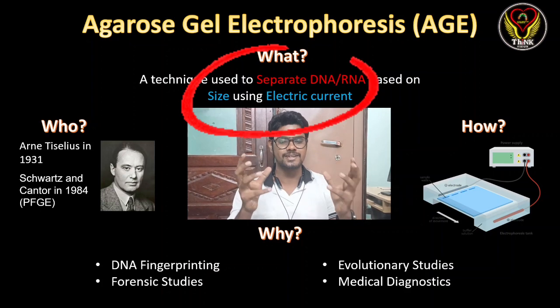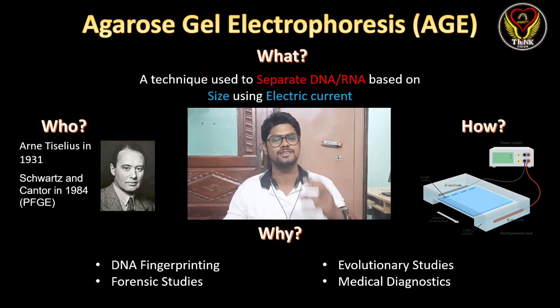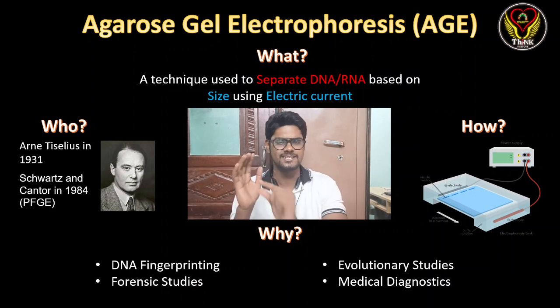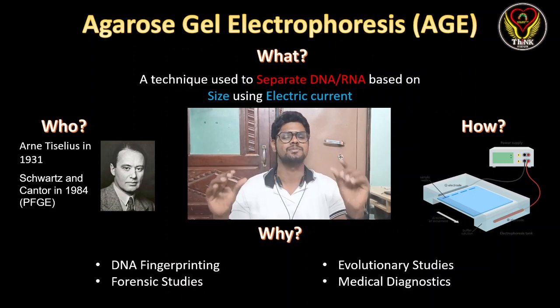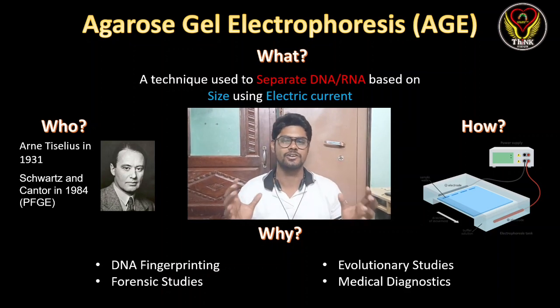So what is this technique? It is a technique used to separate DNA or RNA molecules based on their size using electric current. So using electric current, we separate these DNA and RNA molecules based on their size. Some DNA will be larger, some DNA will be shorter. So based on their size, we will be separating these DNA and RNA molecules.